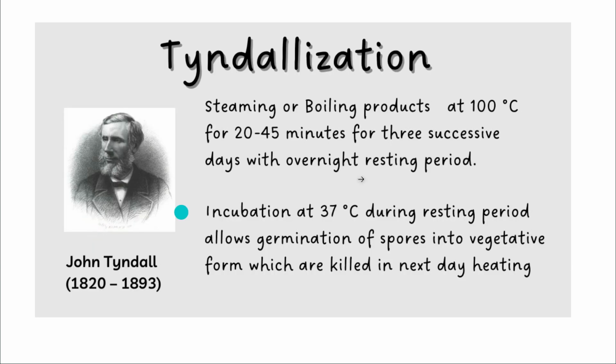As you can see here, this is the Irish scientist John Tyndall. Steaming or boiling the product at 100 degrees Celsius for 20 to 45 minutes for 3 successive days with overnight resting period.